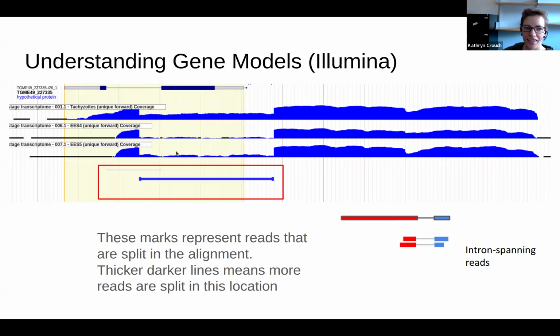You can see that there appears to be a gap, probably an intron, but you can see that that intron actually sits right over where this exon is in the gene model. You can see that there's no transcription at all at this 5' end, and you can see that the transcription at the 3' end extends far beyond where this gene model thinks it stops. So I would guess from this that this gene model here is just wrong, and that in reality we're probably going to start transcription about here. There's an intron from here to here, and then transcription is going to go all the way up to here. And I'd have to look at the sequence to say where's the stop codon, so what's actually translated and what's going to be UTR.